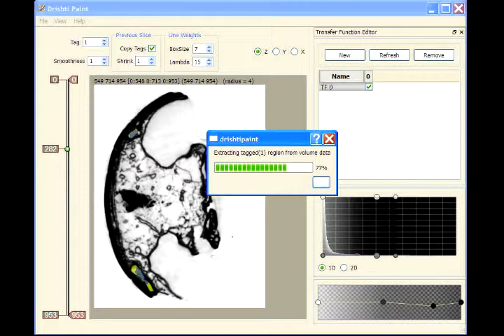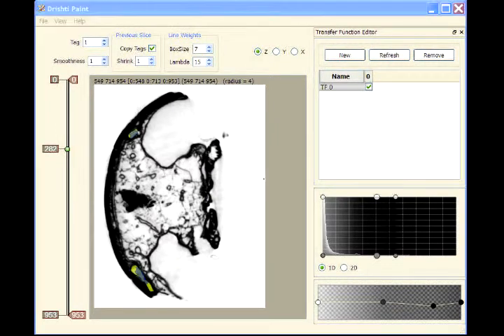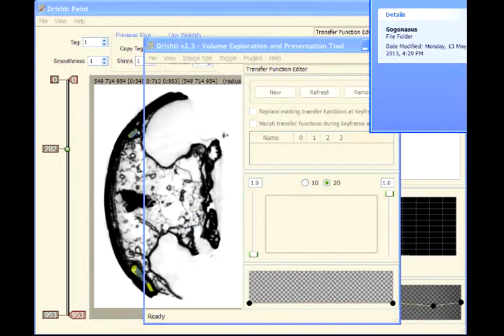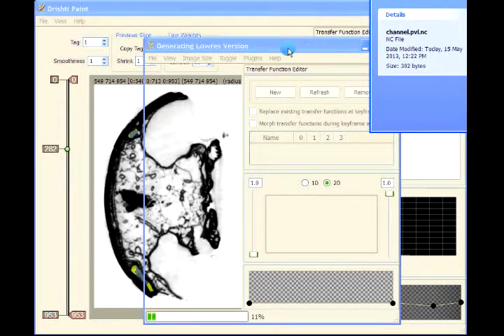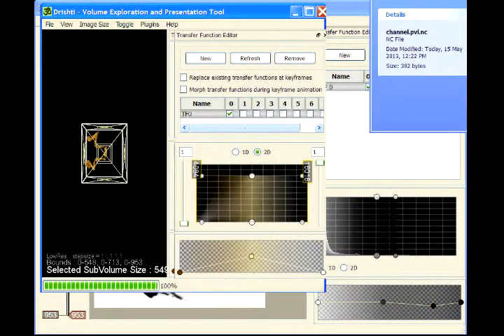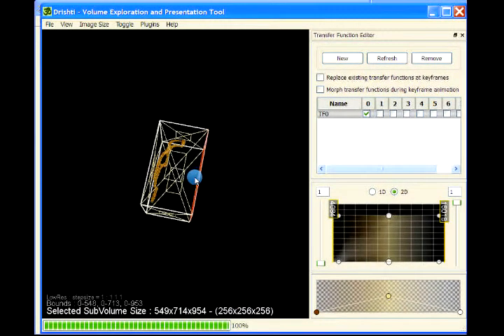So we are applying dilation over the region before extracting the data. So your tags data is going to be dilated, and then that will be used as a mask to extract the image data. So now that we have extracted the channel, let's see the channel. Yeah, so drag and drop the channel. So this is the channel that we have extracted.